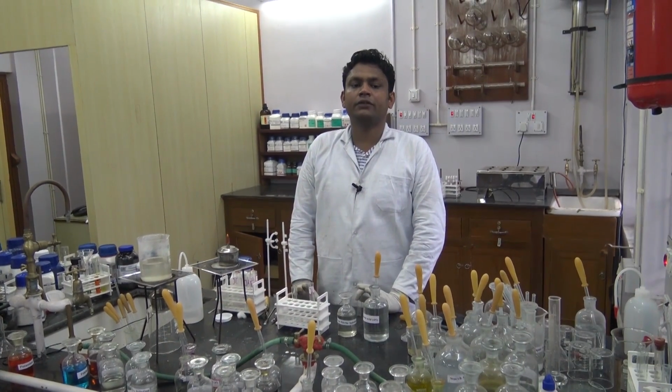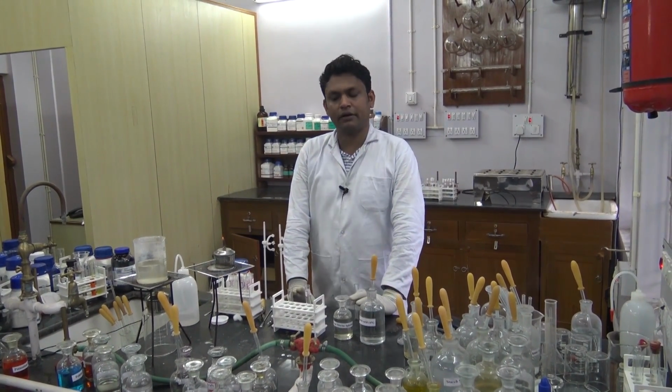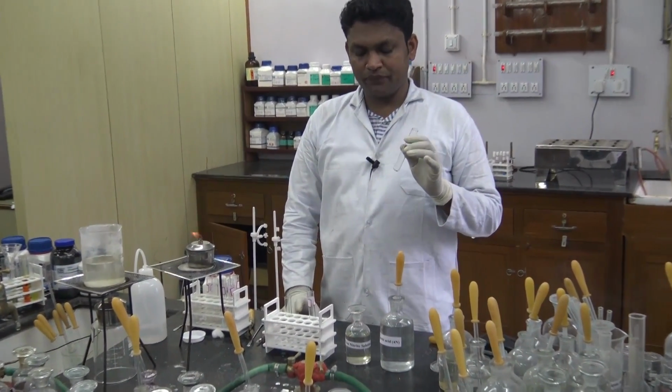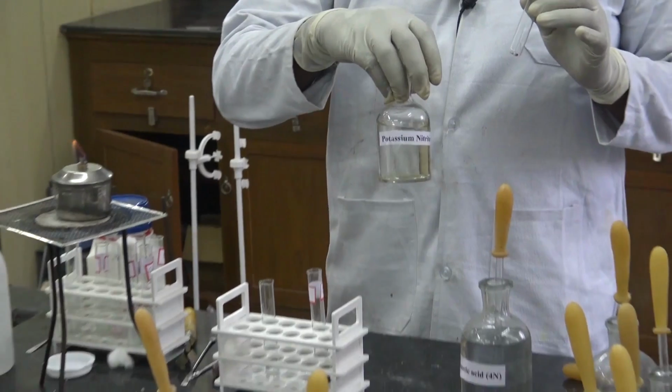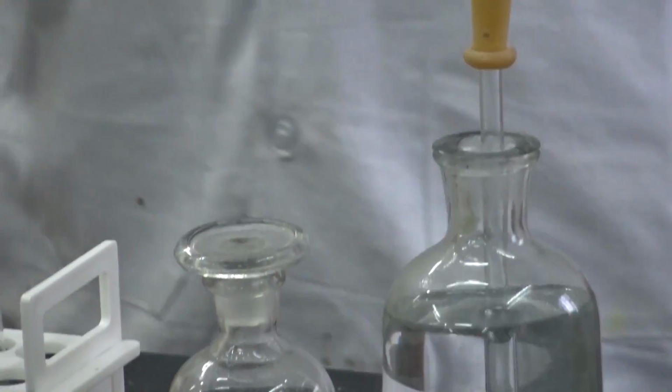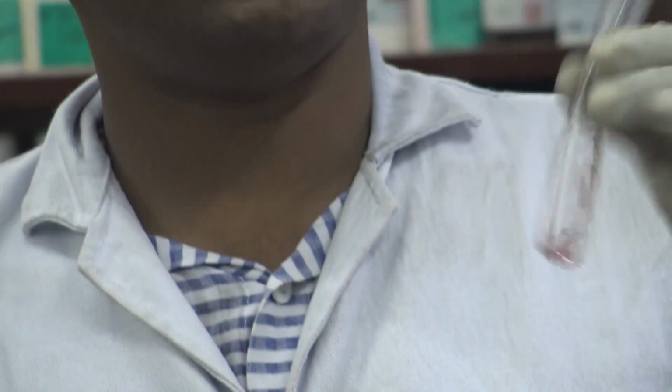Now the confirmatory test for cobalt ion, that is the potassium nitrite test. For this test we require sample solution, potassium nitrite, which may be prepared freshly, and dilute acetic acid solution. For this reaction, at first we have to prepare the sample solution.